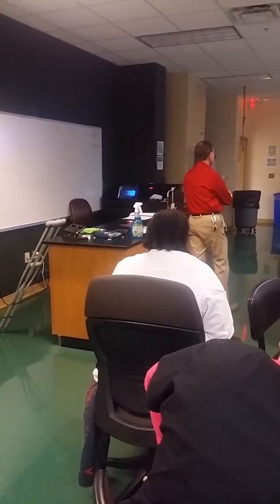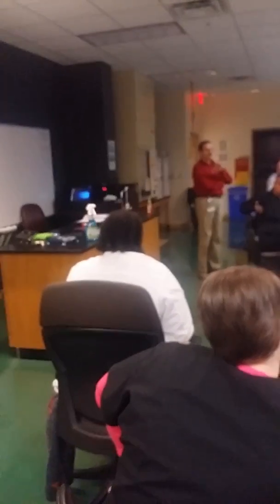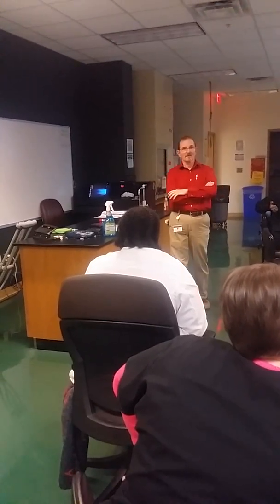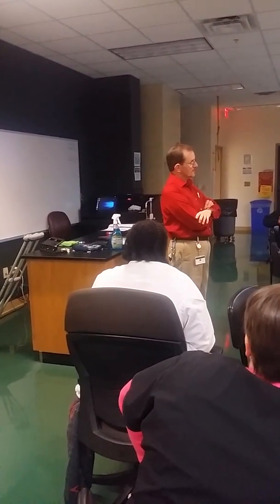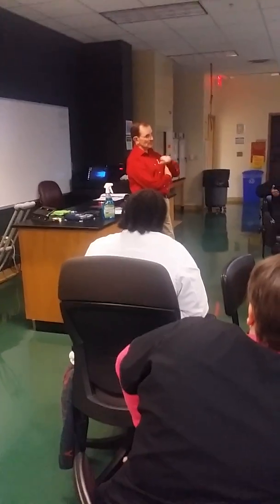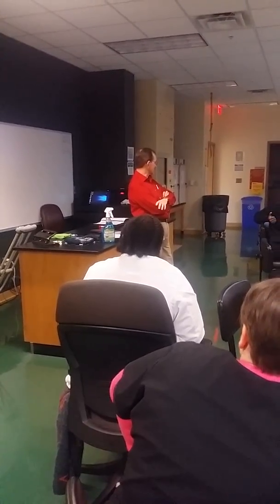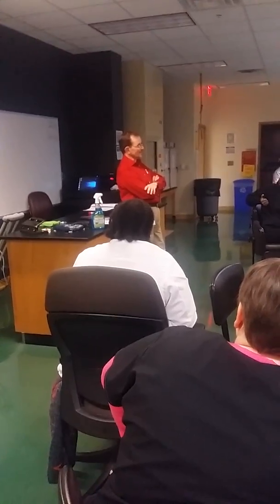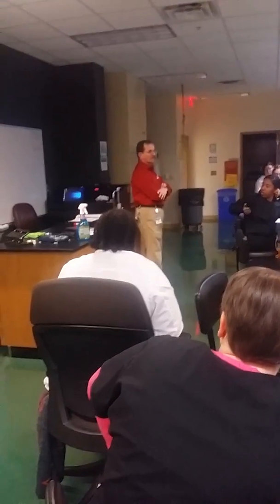And I'll tell you something else that will totally torpedo your grade. And I have folks do this. They don't do the test just on their flow chart. They do all the tests. You try to shotgun it. You try to do all the gram-positive tests for cocci and rod. You cannot do that. Do not. Honestly, guys, it'll confuse you more than it'll help you anyway.